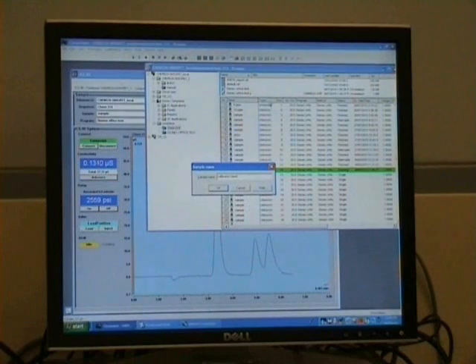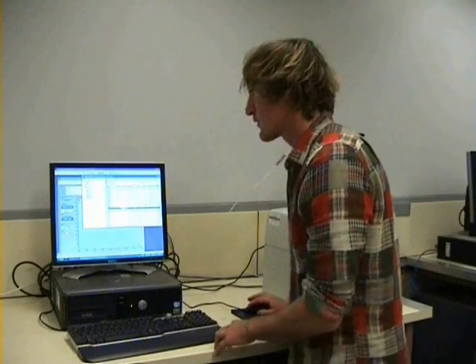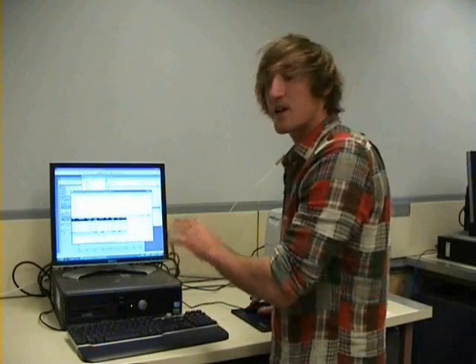In this case, the first sample that we've tested is a calibration standard. Once you've named your sample, if you double-click on it, it will bring up the peak integration, and from here you can print out your results.